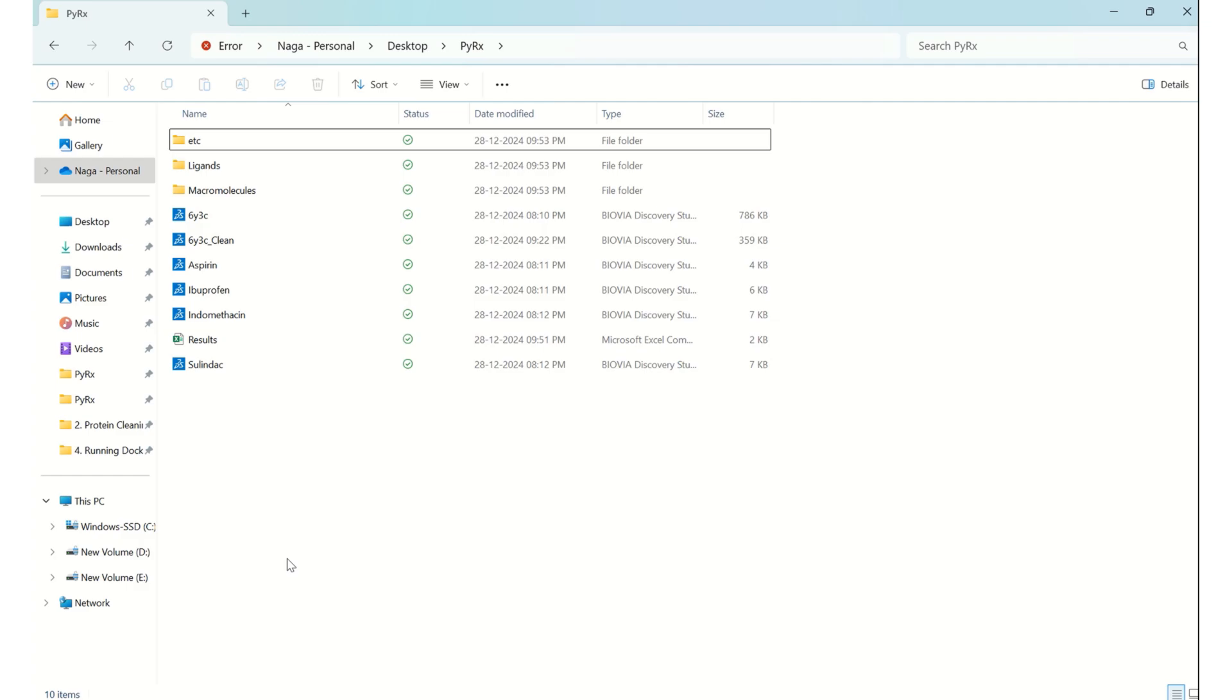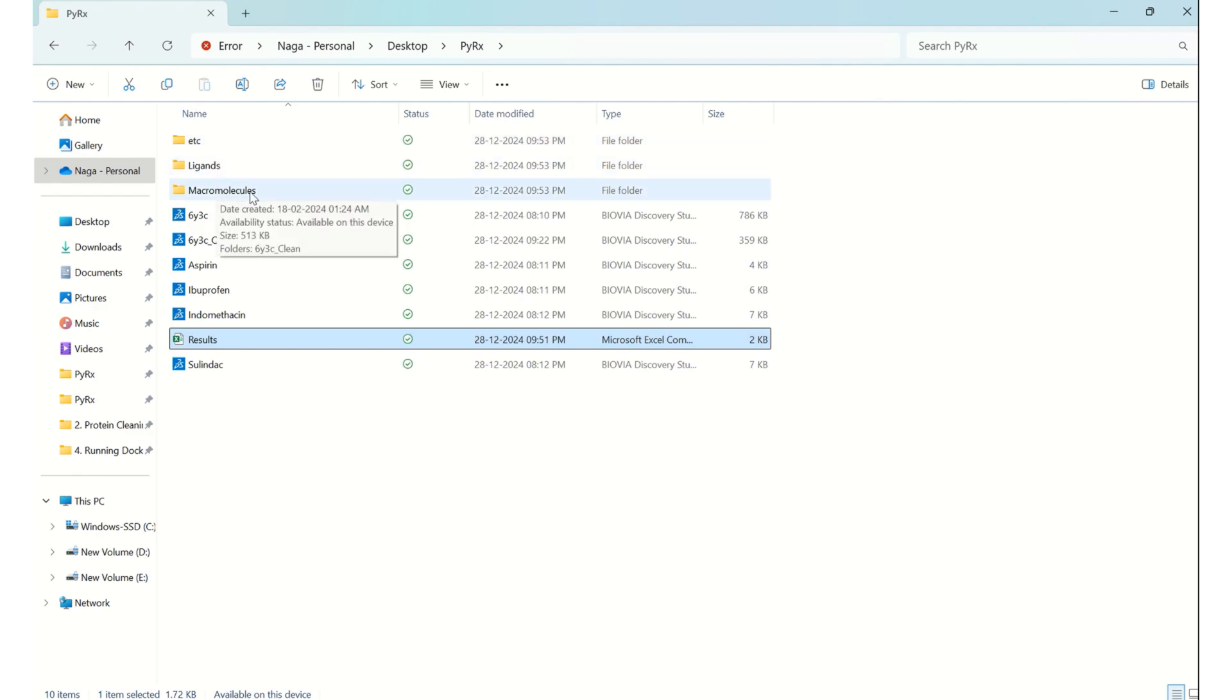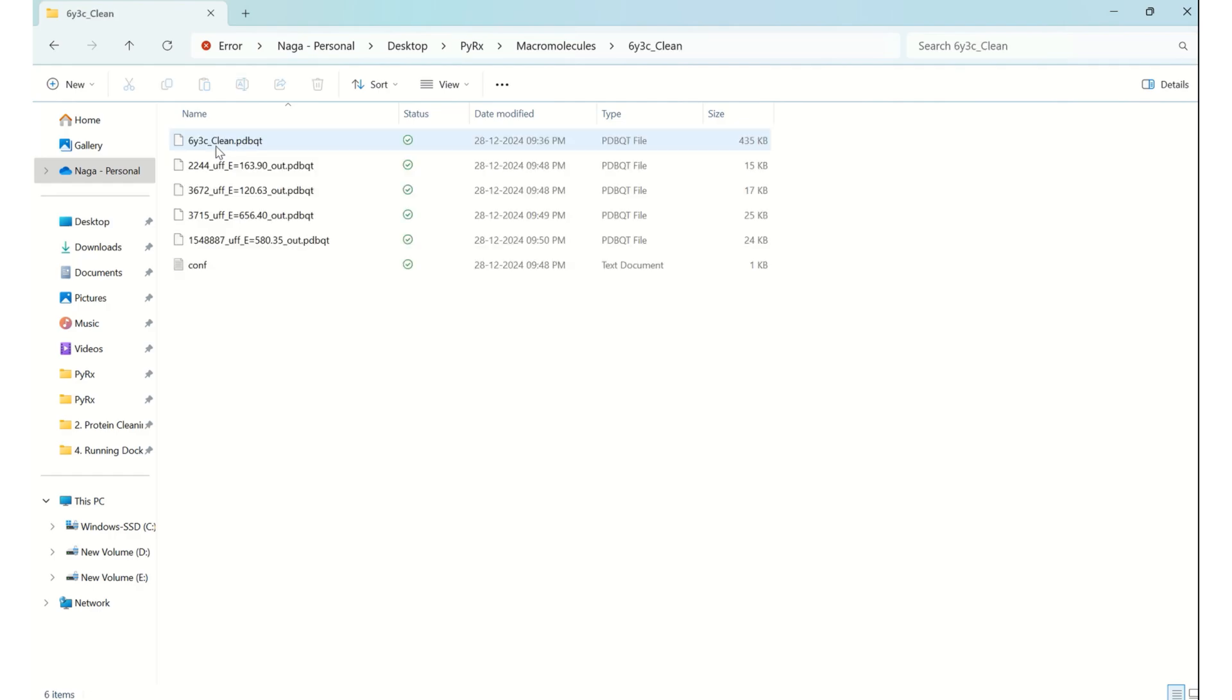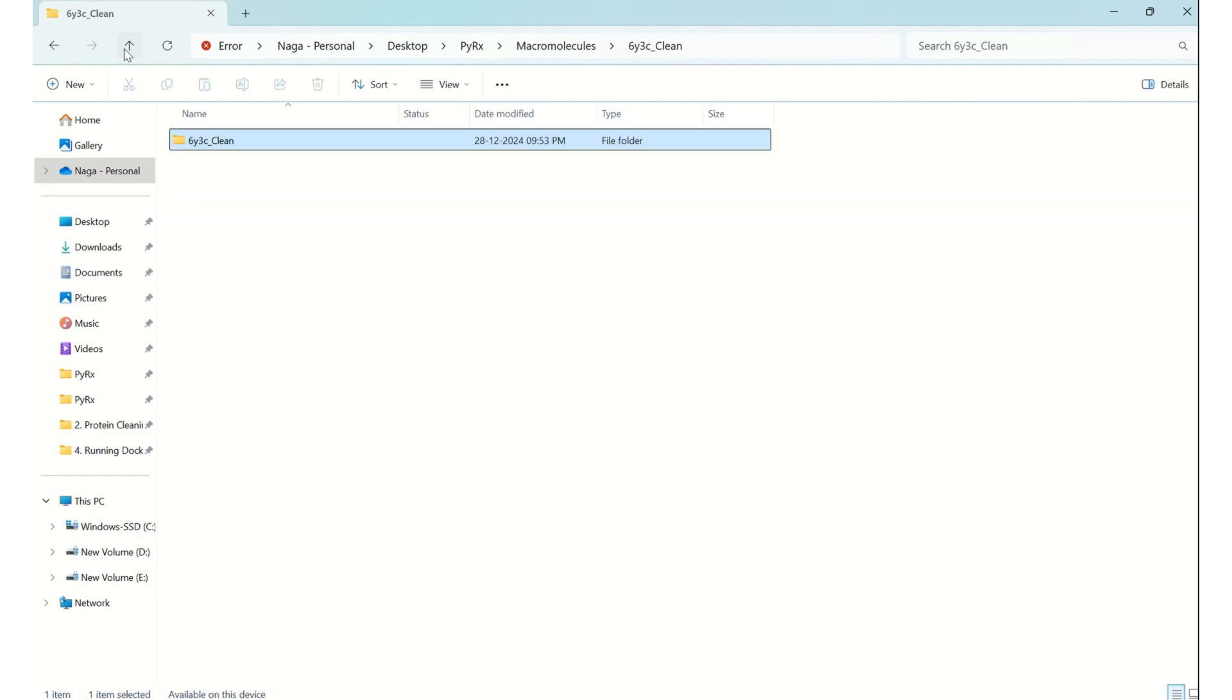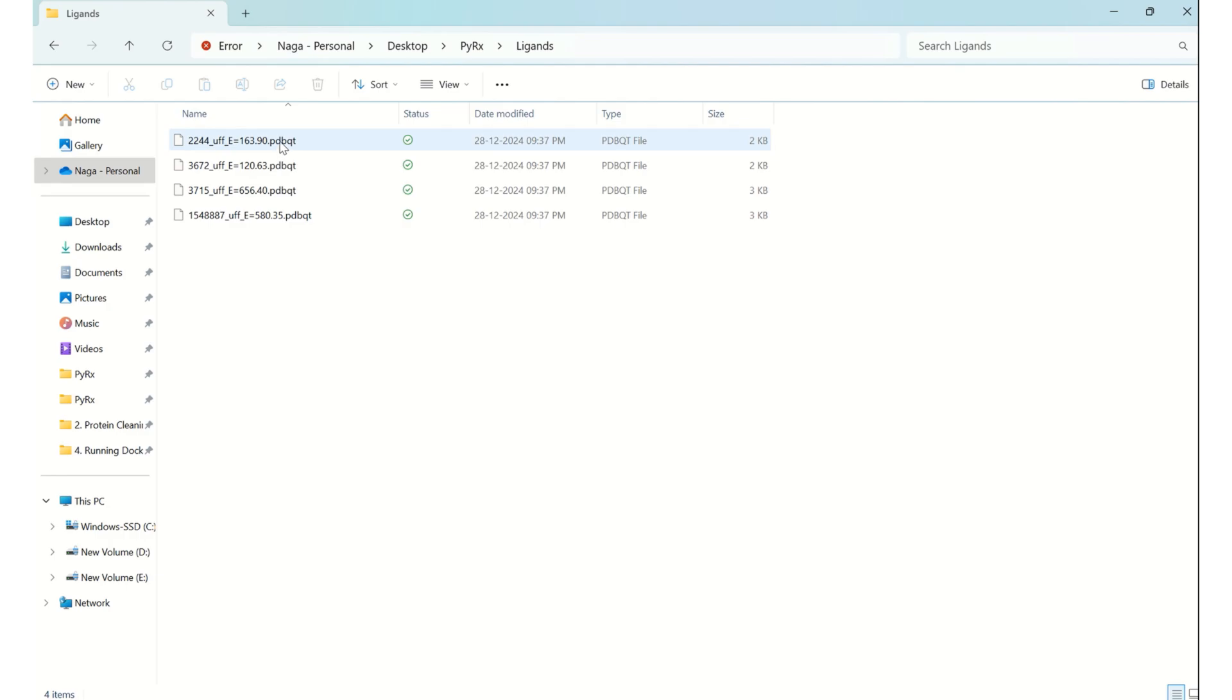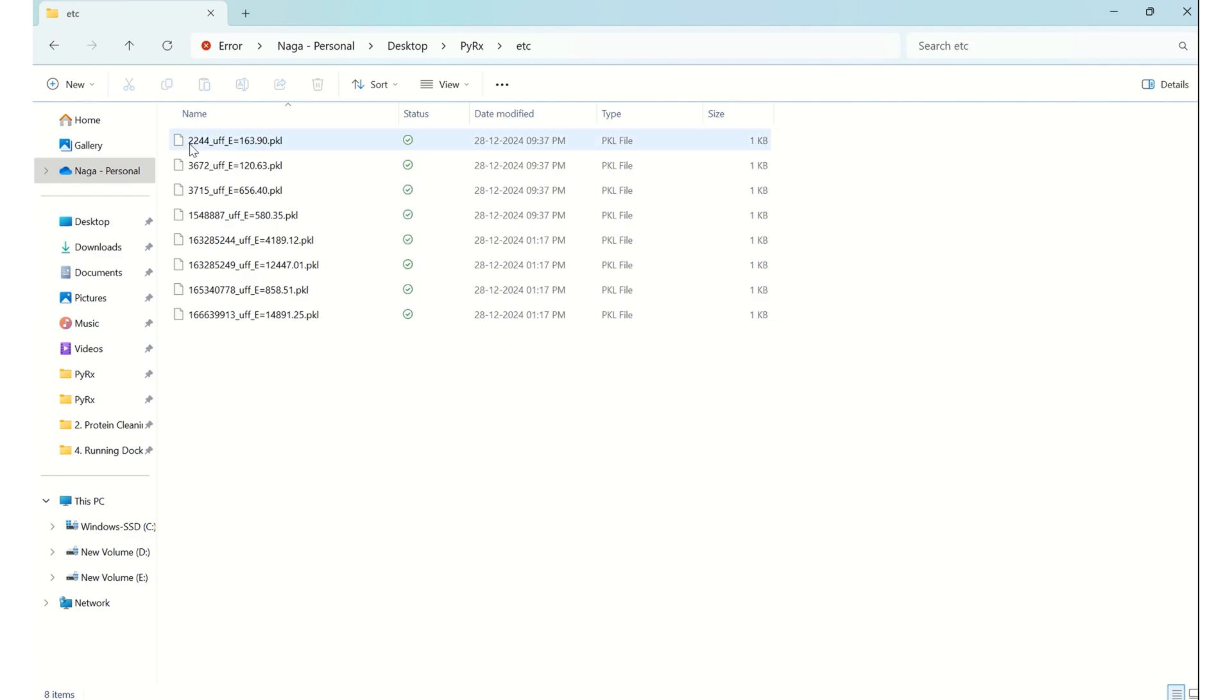After completing this AutoDock Vina simulation, in our working folder we can see the results we saved. Along with this, we can see three more folders which are automatically generated. In 'macromolecules' you can see the folder and the output of each run. In 'ligands' you can see the energy minimized and prepared ligands.